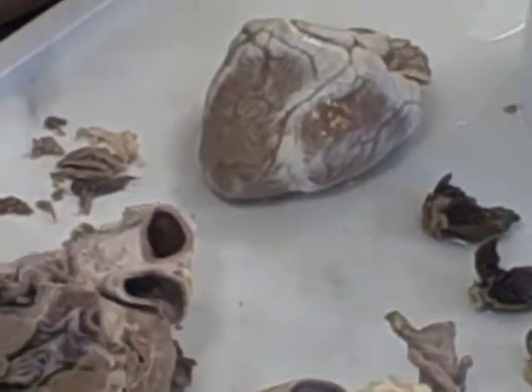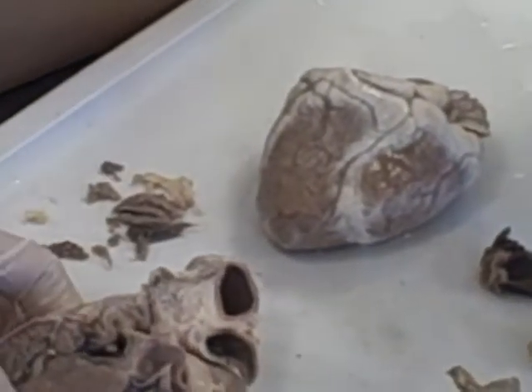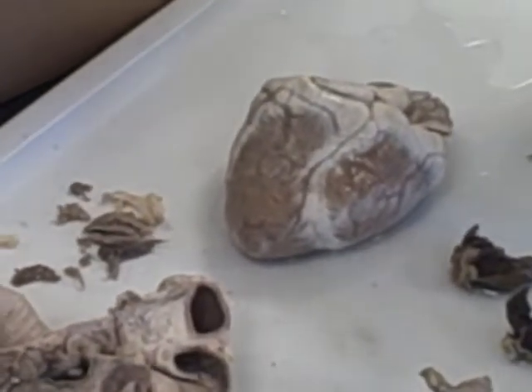And so far, that is how far I've gotten in my dissection of the heart for my independent study on congenital heart defects. Thank you.